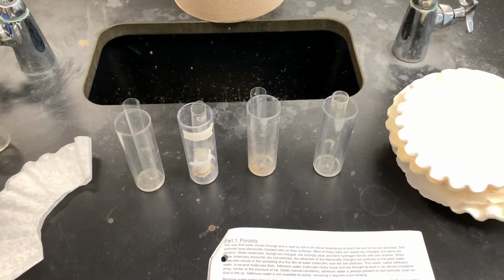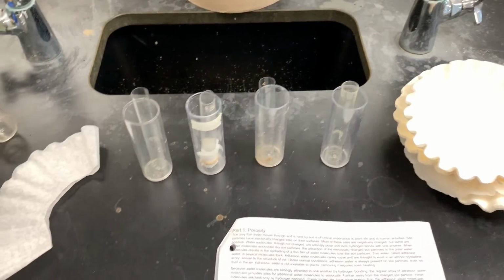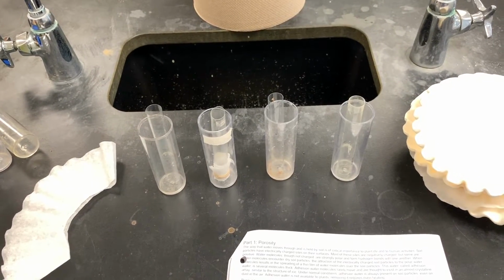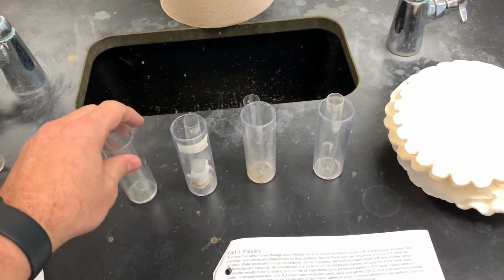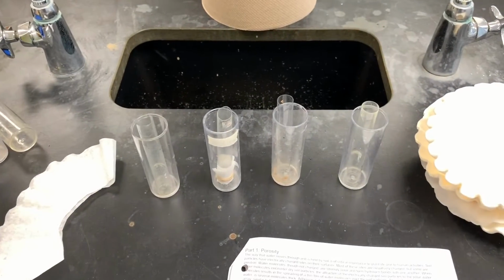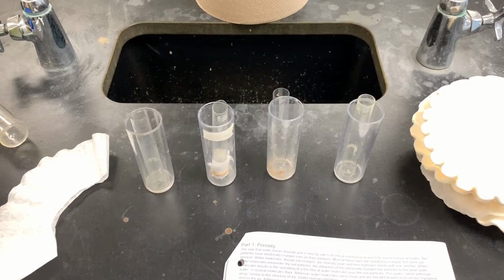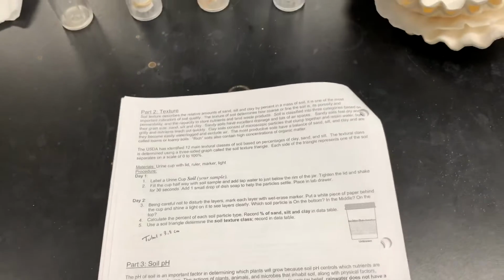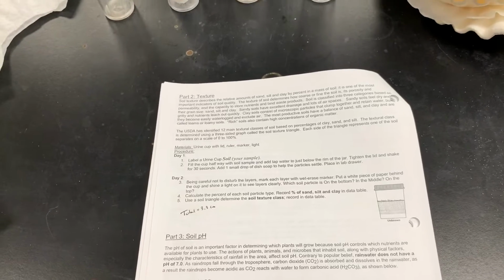So you can see that the different types of soil absorb water differently. And then this 4th one is going to be for your soil sample, which you're going to collect outside. So that's part 1 on porosity. Part 2 is on texture.